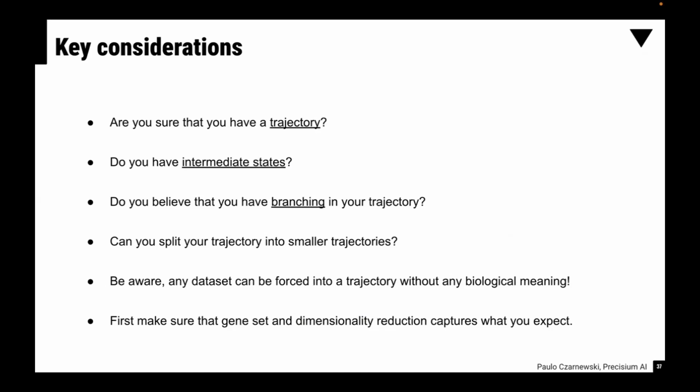So take the T cells specific to what you want to run the trajectory on, then run highly variable gene selection, scale the data, and do Harmony integration, and then you will create a trajectory that only fits the T cells. Once you draw the trajectory on these, it will much more recapitulate biology rather than artifacts because of the selection of the genes.